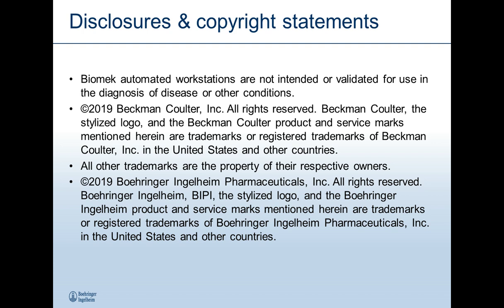Another way of looking at it is incubating your plates within a humidified environment to keep that evaporation to a minimum. A lot of it depends on the resources that you have available and the general environment that you're working in.